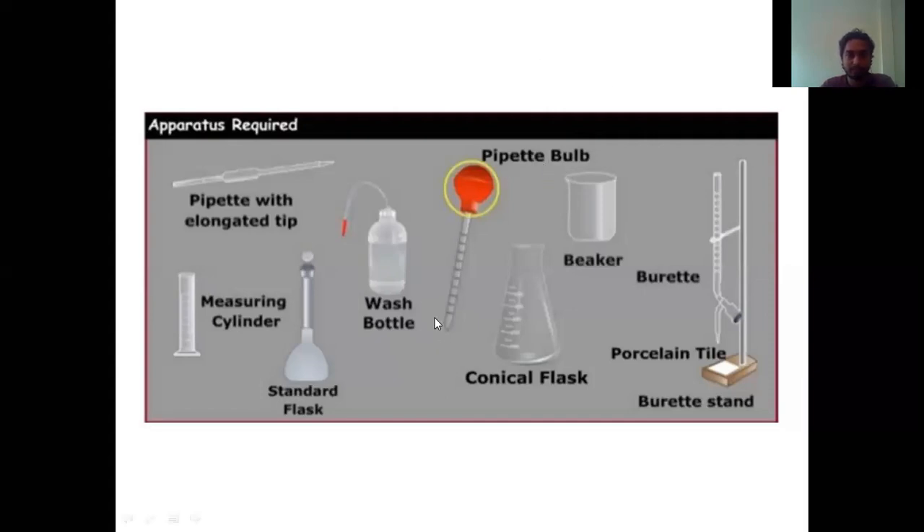Next comes this pipette bulb, which is also used to draw the chemicals. Next is this conical flask, placed at the bottom of the burette stand. The conical flask is used to take the chemicals and stir them properly. Next comes the beaker, which is used to store and take the chemicals. Last is this burette stand. The burette is fixed onto the burette stand. In this burette we add the chemical and drip it down at the tip — we add the chemical drop by drop, which is why we use the burette rather than a beaker.